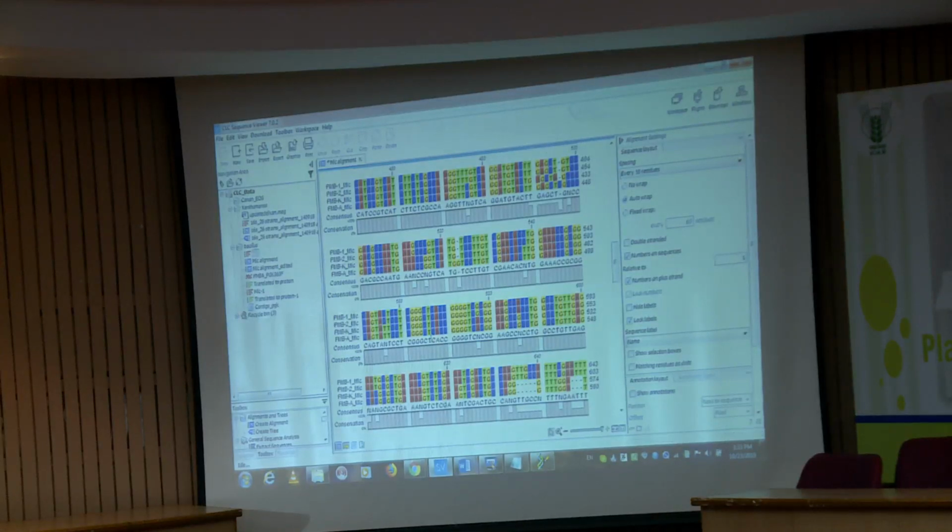But again, now the question is whether this C or G are actually different or it is some misread. So for that purpose, you will have to go back to your FASTA, those chromatogram files, and verify. One by one you have to do. What you will be doing?